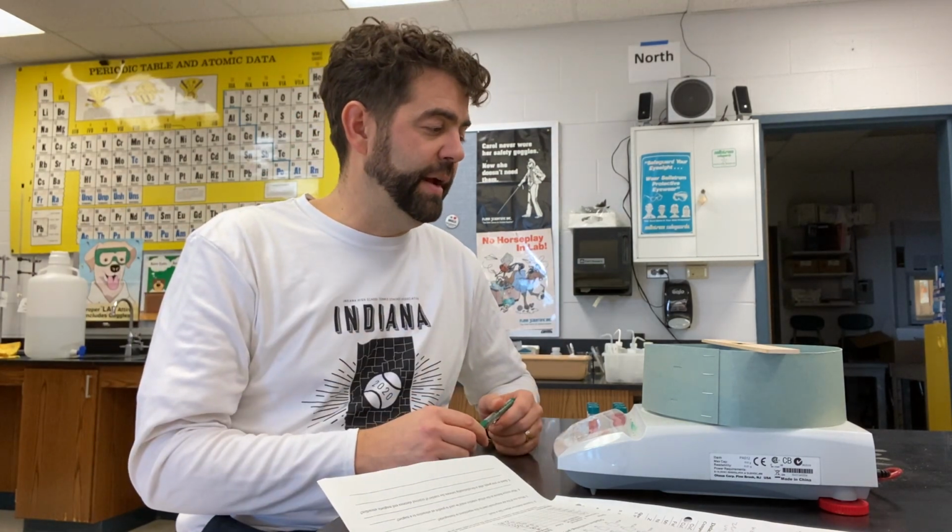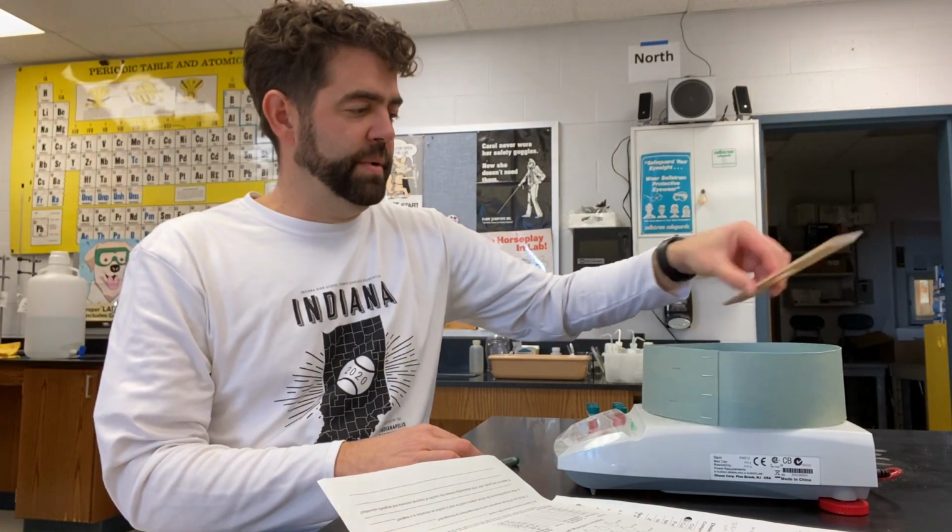All right, hey chemistry people, we're gonna do this lab here. This is a great lab to see the indirect evidence for electron configuration. It's tough to see electrons. In fact, it's impossible to see electrons. So this lab is great. Let me break it down here.